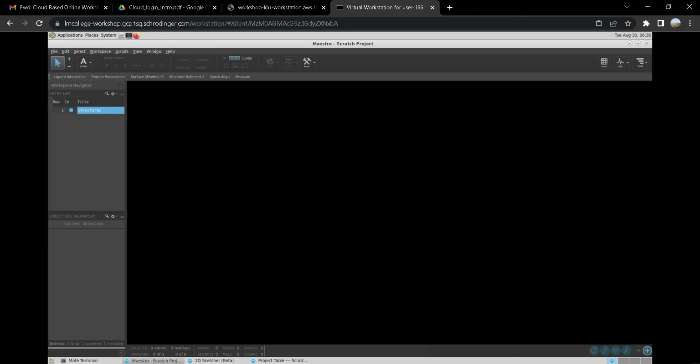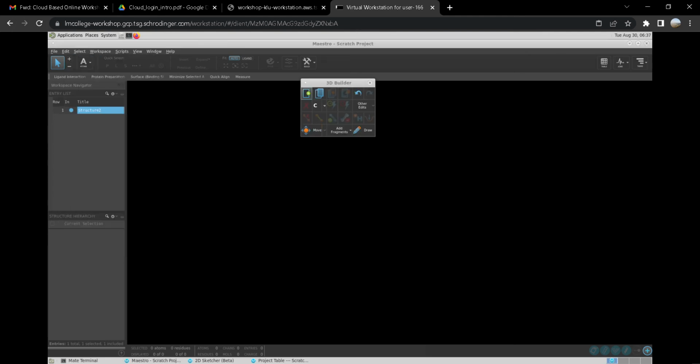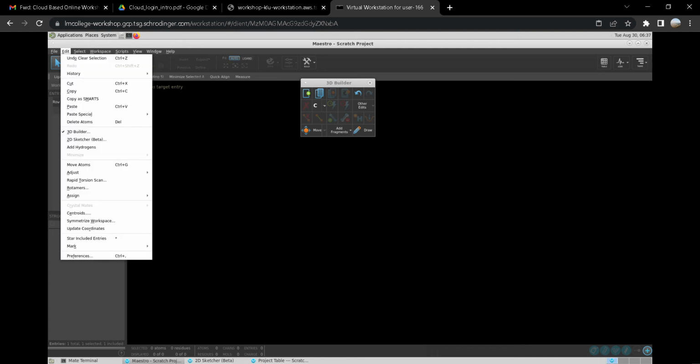How can I add other atoms or isotopes? I think I just discussed that, Navneet, but not isotopes; I'm quite doubtful. Can you elaborate what exactly? I think that is difficult. I know there are different isotopes of different elements, which I doubt. It's an interesting question. I need to check with my team members on that.